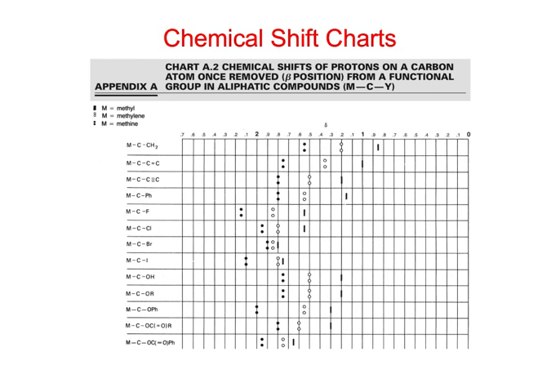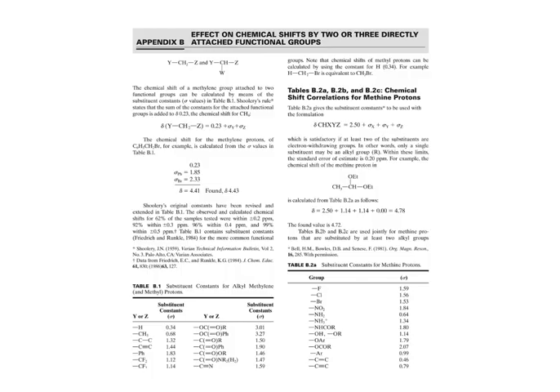So these inductive effects do have an effect over more than one position, but the impact drops as it gets farther away. Now there's also these tables, and I think this is essentially what the NMR prediction programs do, is they calculate these tables, or similar ones.